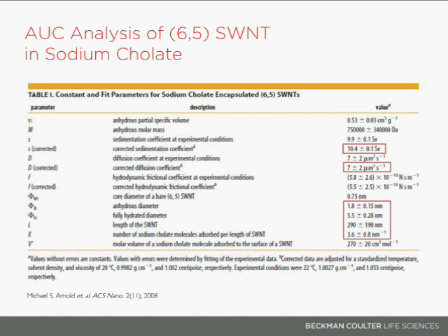And finally, they're able to derive the exact number of sodium cholate molecules per length of carbon nanotube. So now you're getting an idea of how many cholate molecules are there per nanometer of carbon nanotube. What's the coverage percentage? How much is bare carbon nanotube? How much is surfactant? And this can lead, I believe, to more precise in vivo studies of carbon nanotubes and generally nanoparticles as a whole.